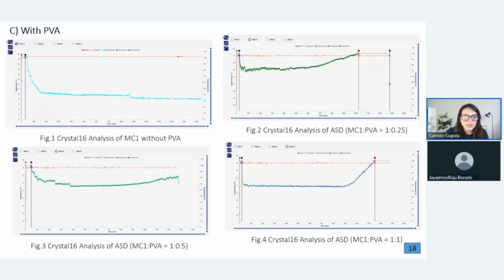Somebody else is saying, I think this experiment time and concentration is based on the maximum daily dose of API to polymer ratio, with at least 4 hours of time. Does this make sense? Somebody is saying that the experiment time and concentration used is based on the maximum daily dose of the API and polymer ratio. Is this right?